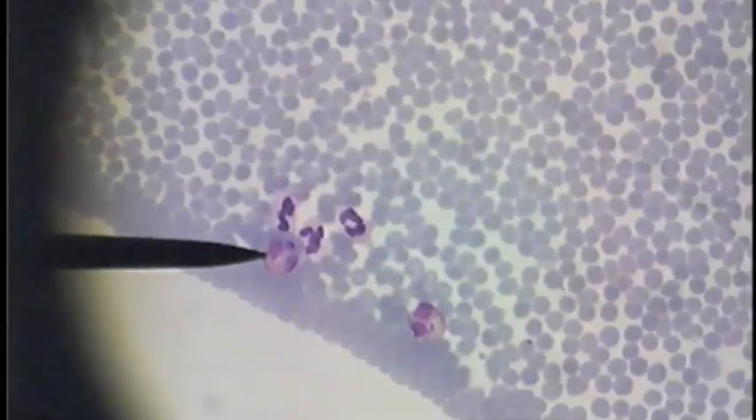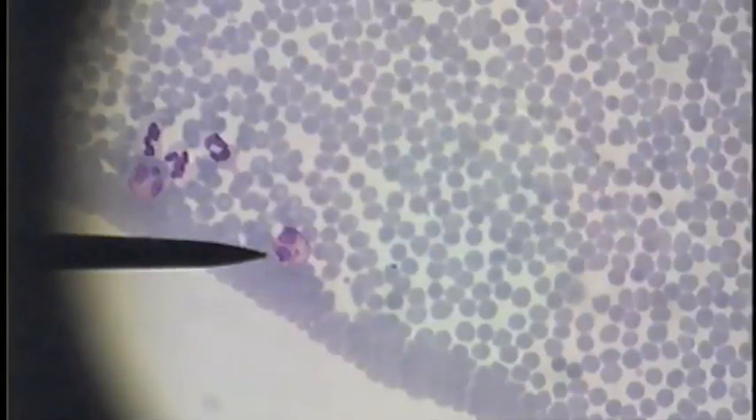This is an eosinophil, distinguished by its two large-lobed nuclei and a reddish granular cytoplasm. Here's another eosinophil with a bunch of other neutrophils. Here's another eosinophil with a two-lobed nucleus. Here's another neutrophil and yet another eosinophil.